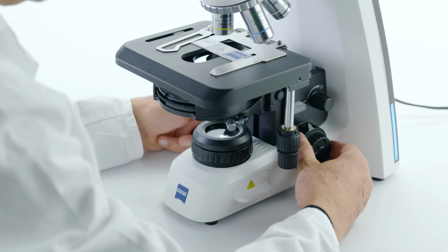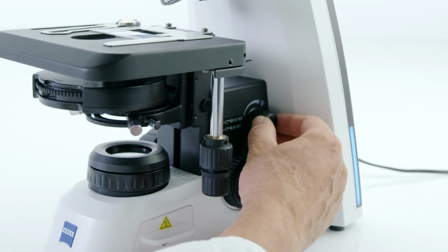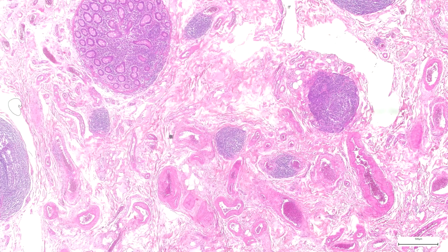Now you're ready to focus until you see a clear, sharp image with fine structures. If necessary, adjust the brightness of your illumination, then press Snap. That was simple, wasn't it?